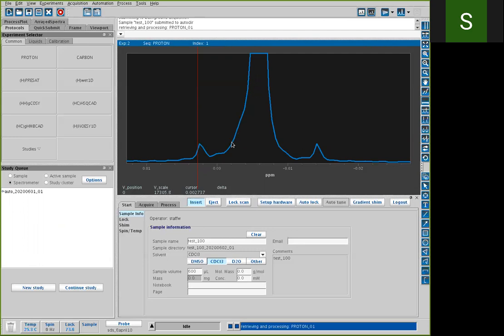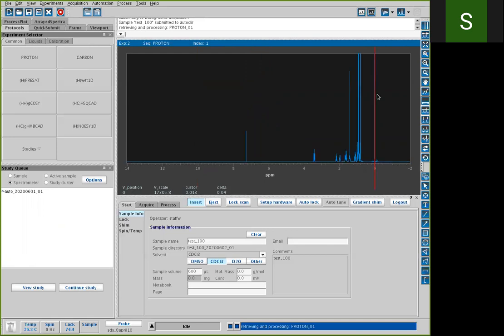If you're seeing the signal resolve close to the baseline between the main peak and the silicon satellites, your shimming is very good. As your shimming starts to get poor, the base starts drifting out and will cover up these peaks. That's a good indication of how well you're shimmed. So this one went well, and like I say, it's always a good thing to check.